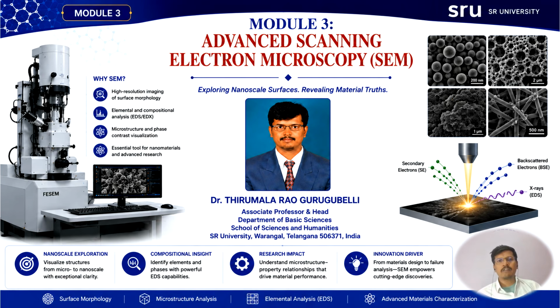Whether we are developing a photocatalyst, a battery material, a supercapacitor, a sensor, or any biomedical material, SEM helps us understand how the structure influences the properties and how the morphology affects the performance.